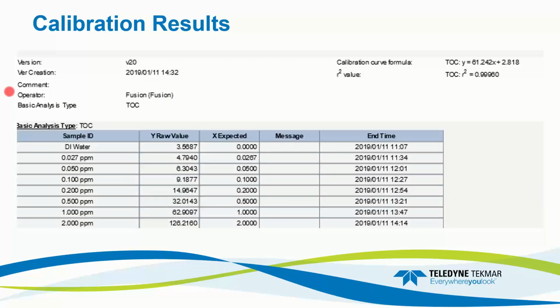So when we look at the calibration results, our criteria was that we needed to be 3 nines or better. And that was achieved by doing the auto dilution via the system. And that's how we got the calibration curve presented in front of you.